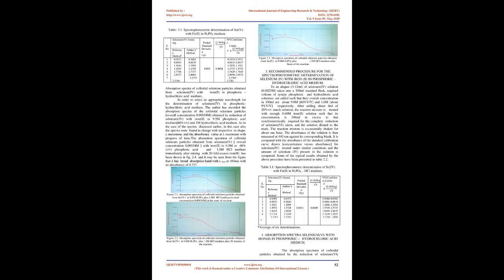1.4 Starch solution. An approximately 20% W/V solution of starch has been prepared and utilized as a protective colloid in the determination to keep the selenium colloidal particles under suspension in the solution. AR-grade syrupy phosphoric and hydrochloric acids have been utilized in this investigation.